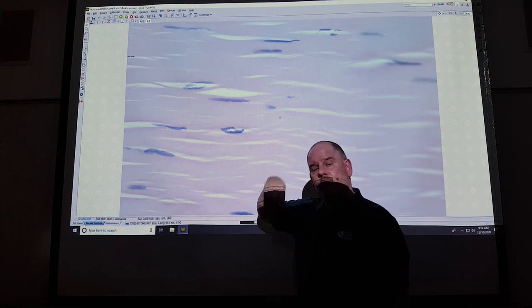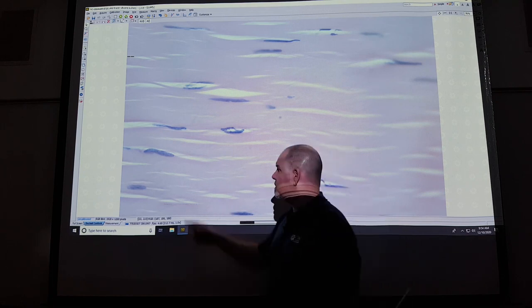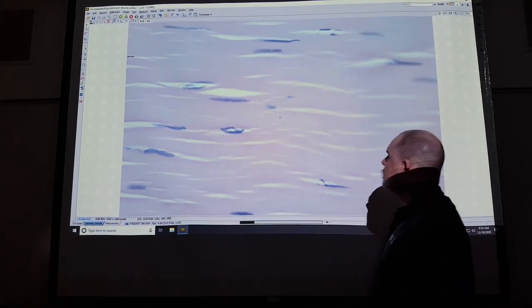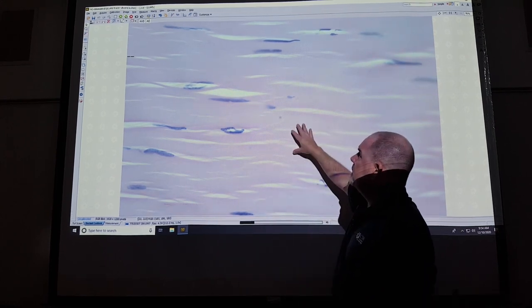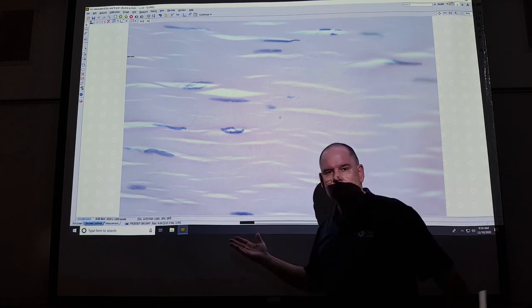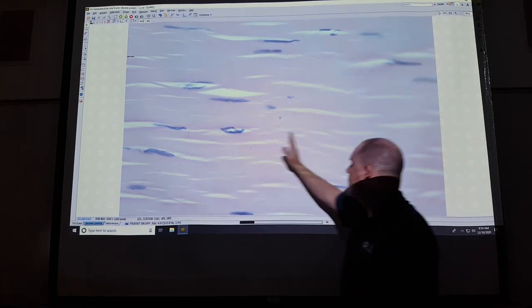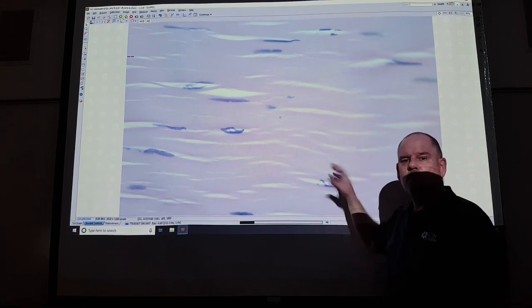If I think of areolar connective tissue as hairyolar connective tissue, it's not that much of a stretch to see this as a micrograph of, say, wavy hair. Hair that has small curls in it. Hair that has been permed. Since it's stained a reddish color and I just happened to have streamed The Undoing, mystery, I won't spoil the mystery, no spoilers, but this is Nicole Kidman's hair. How's that?